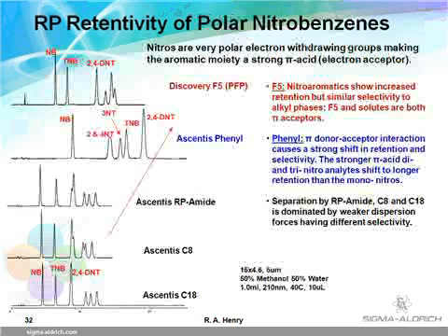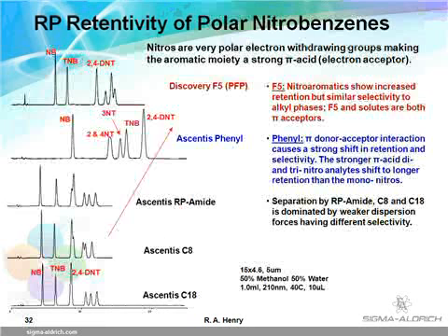When even small molecules have a polar functional group, such as nitro, hydroxyl, amino, and many others, the phases with built-in polarity and polarizability can show better retention and selectivity, as shown in this next slide. Note that this is the case for the simple nitroaromatics.